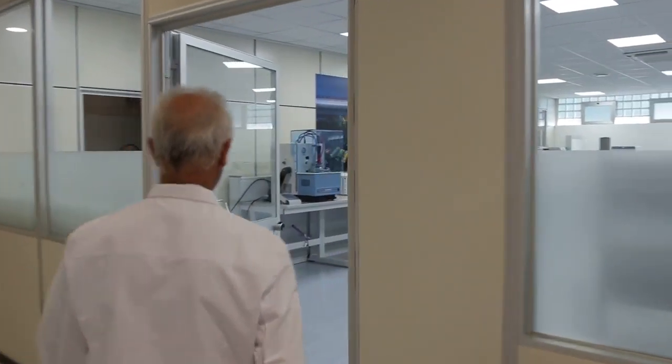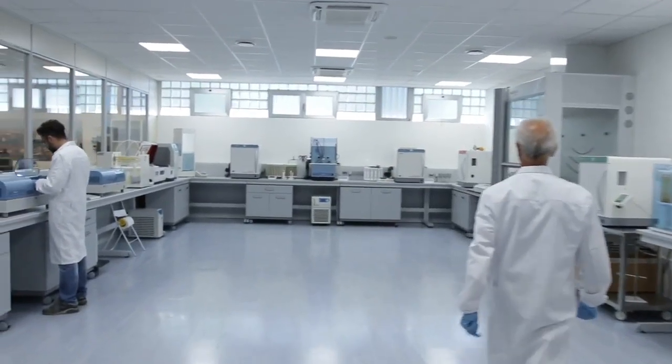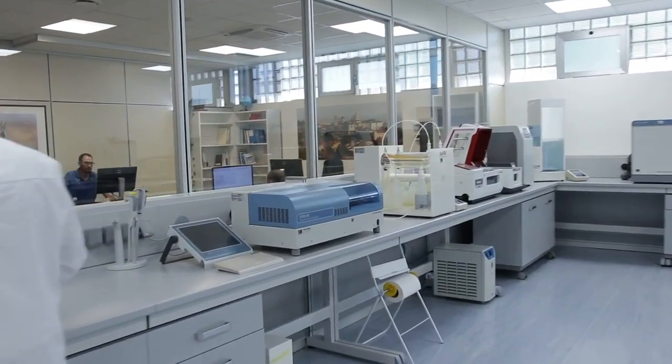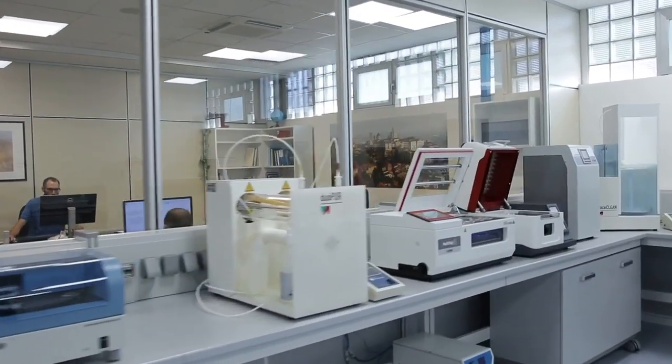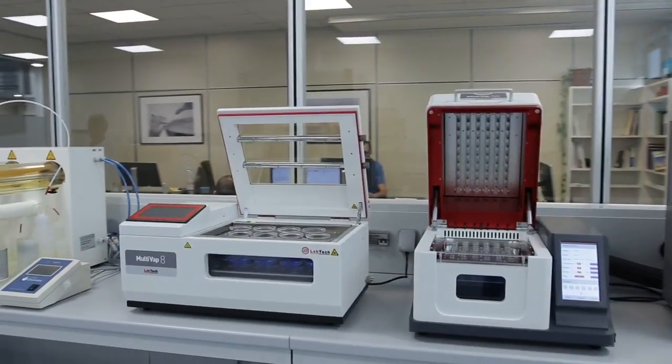Efficiency and precision are more and more requested in any kind of modern lab. Sample quality is a crucial issue for any kind of application and Labtech's instruments can give an excellent contribution to the daily job.